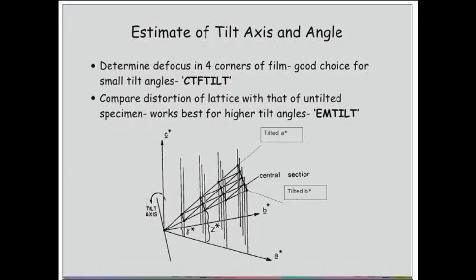So we've collected our data from our tilted crystal, and let's assume that we've been able to index it. So we can determine the crystal lattice parameters. So we've got H and K values for the spots. Now, in principle, that sounds straightforward. In practice, with highly tilted images, it can be rather difficult. So it may require a little bit of thought about getting the indexing right.